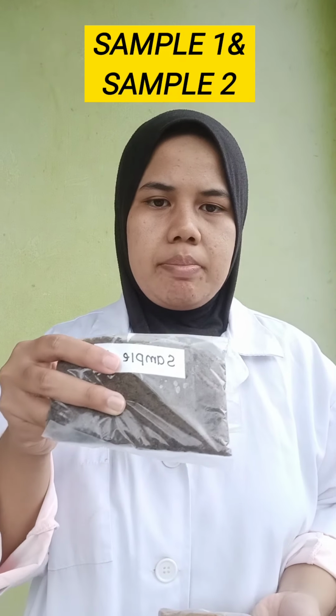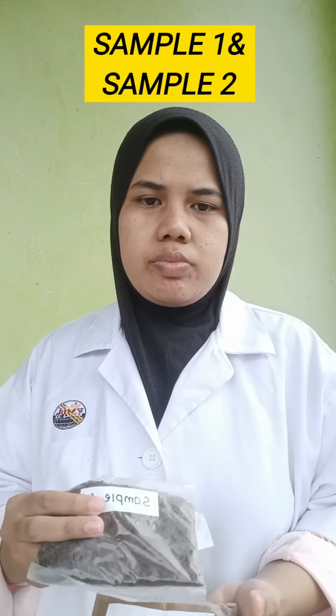So to conduct the experiment, the materials that we need are soil sample 1 and soil sample 2, a bottle of water and a ruler. Okay, the first step for this experiment is we need to place 1 tablespoon of soil sample in your palm. Okay, this is sample 1.